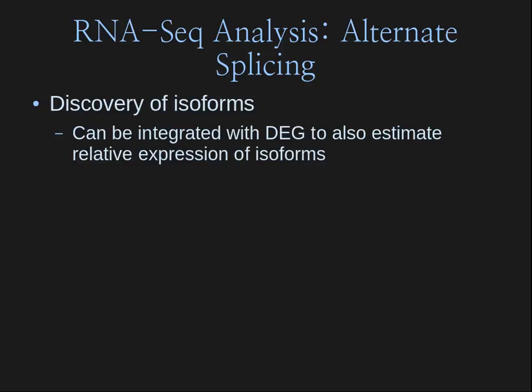And this is imagining we do not know what isoforms are present. So we don't know if there is also BC or ABC. We don't know if those are present. This is what's actually present in reality, but we don't know that. So the only ones that are really informative for that are these coverage ones. Well, directly informative for that. So you need these ones that cover these junctions between exons.